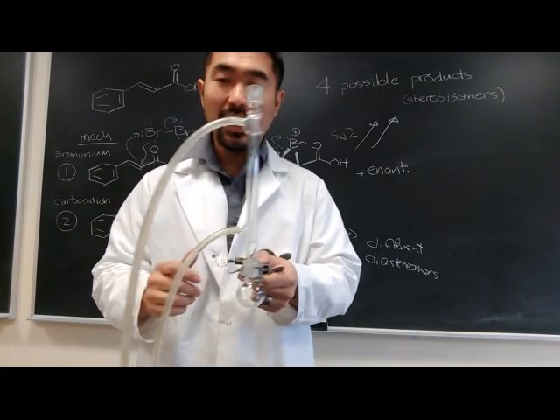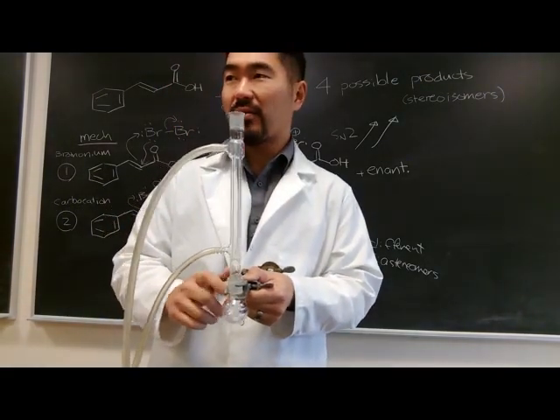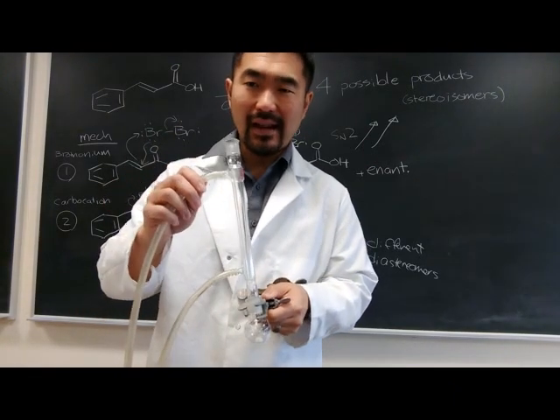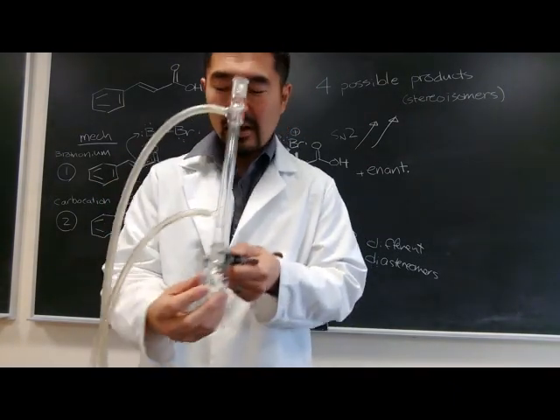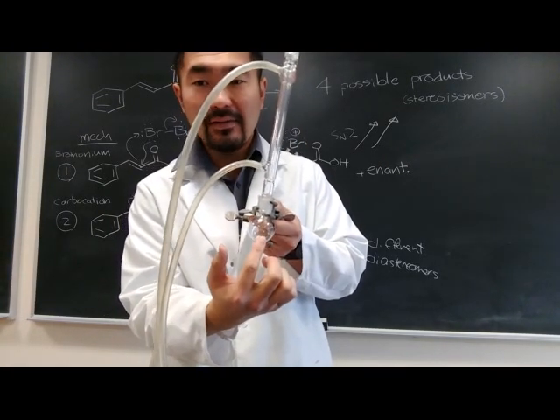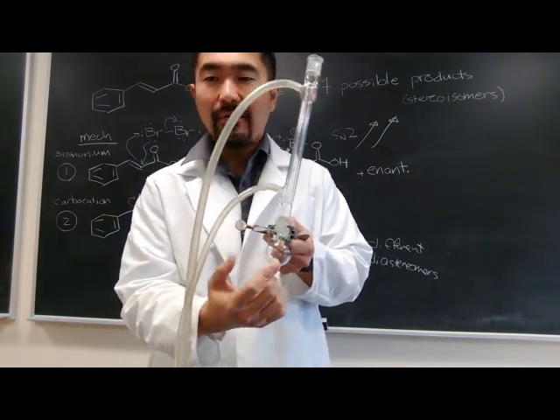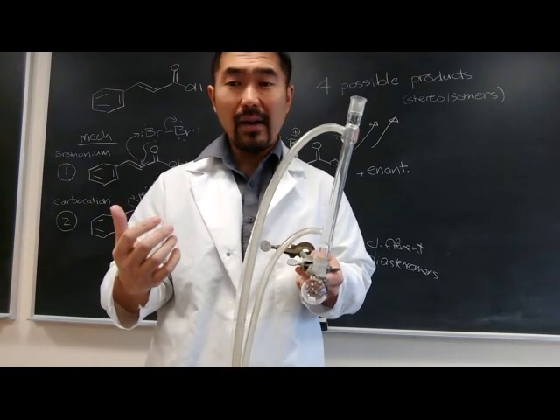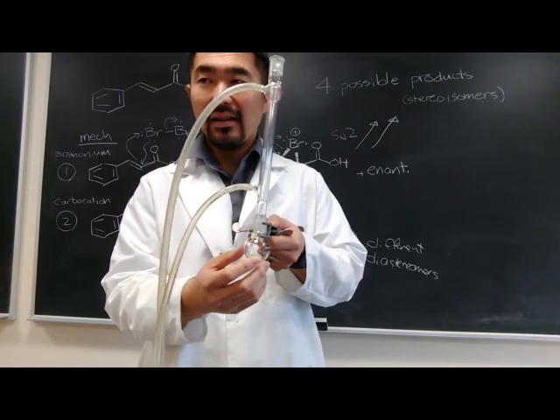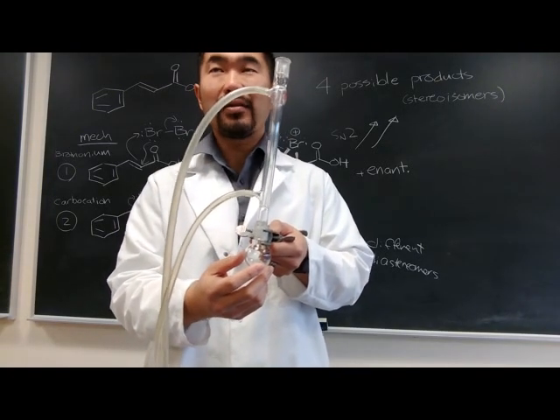Now, as far as what temperature of hot water bath you should have, I want you to think about that. In thinking about that though, look up the boiling point for dichloromethane, which is the solvent that's in here. There's no reason to go above the boiling point of the solvent for the water bath, or there's no reason to go above it by too much.